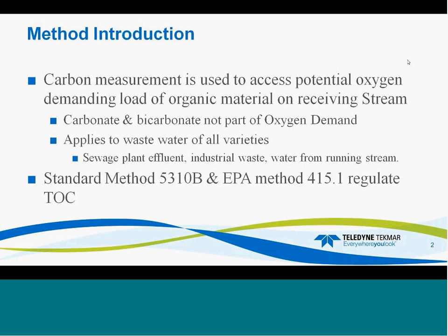So standard method 5310B and EPA method 415.1 came out to regulate how much TOC is acceptable to be discharged and how we need to transport. And so it dictates that inorganic carbon needs to be sparged out.